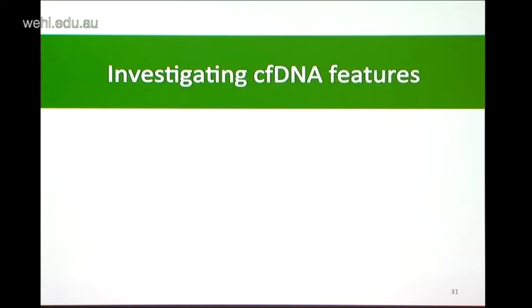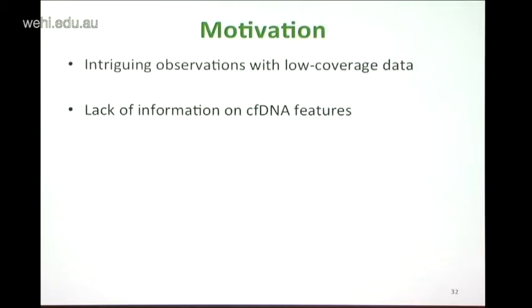Right, so that brings us to the second section of my talk. And this is where we started investigating the features specific to cell-free DNA. The motivation behind this was that we started observing some really interesting signals when we were looking at the low coverage data.